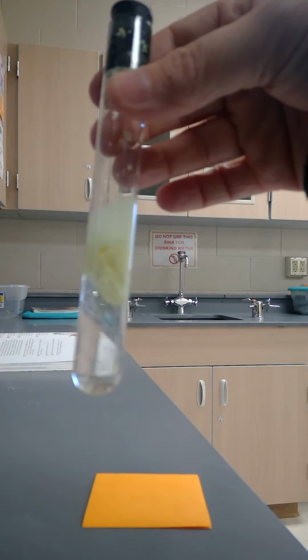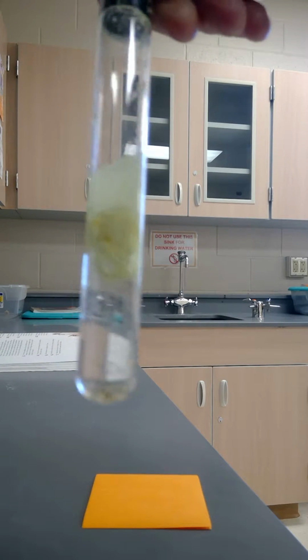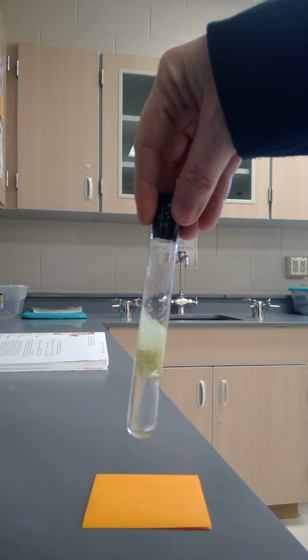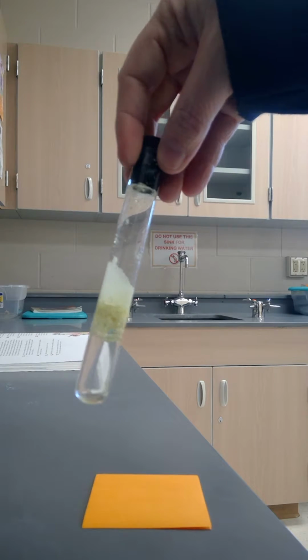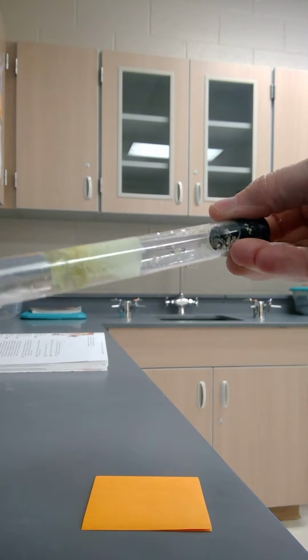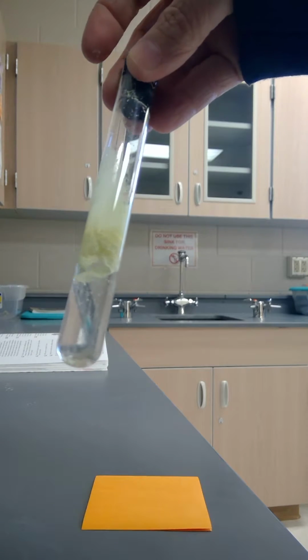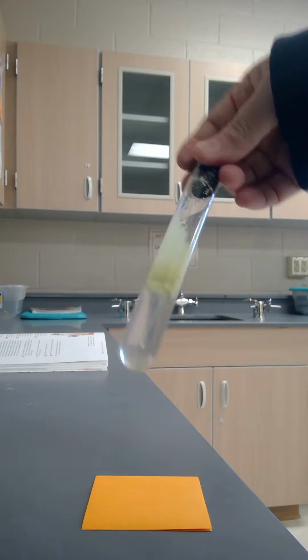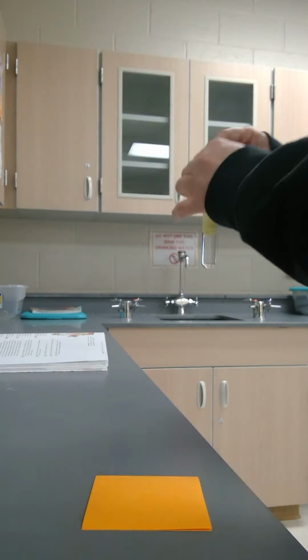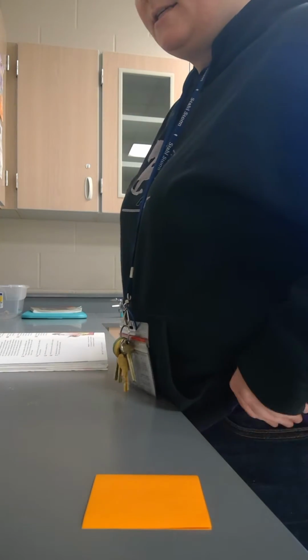Oh, sorry. Here you go. So I mixed it those 10 times. And again, now I'm going to go ahead and I'm going to look at, again, what we call our observational properties. So again, slightly broken apart, floating on top, a couple have sunk to the bottom, kind of hard to see that. And then I'm going to set that aside. Go ahead and document. Did it dissolve? Did it not dissolve? With a yes or a no.